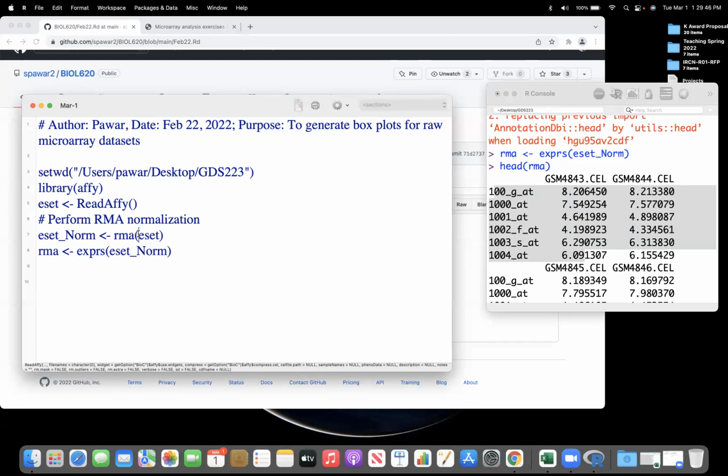Yeah, can you run line two? Now you run line 4. Now 6 and 7.